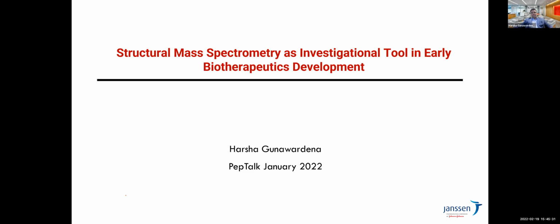In today's presentation, I will focus on how we were able to use a variety of structural mass spectrometry tools to investigate the binding of a bispecific antibody. I hope you will have an appreciation for the tools and techniques presented today for understanding the higher order structures of antibodies entering cell engineering and early development.